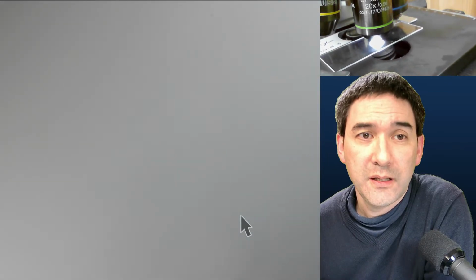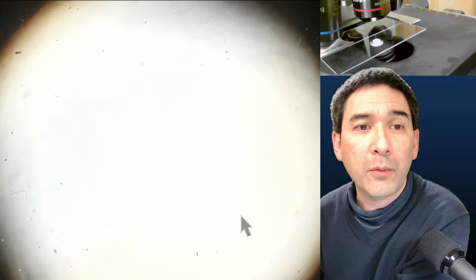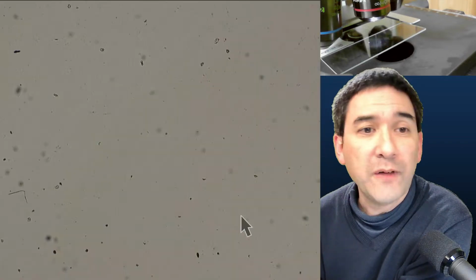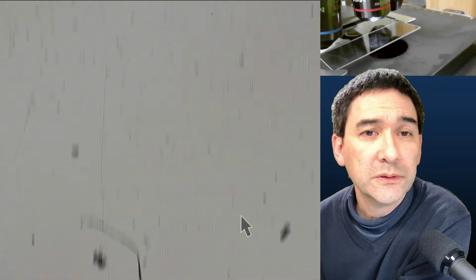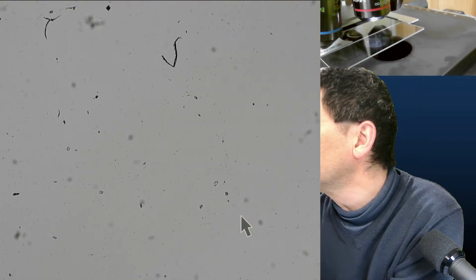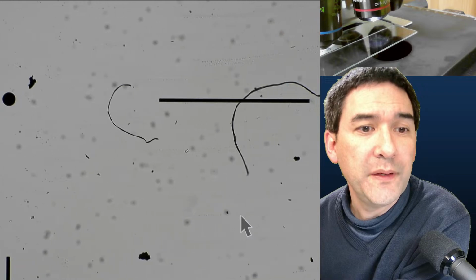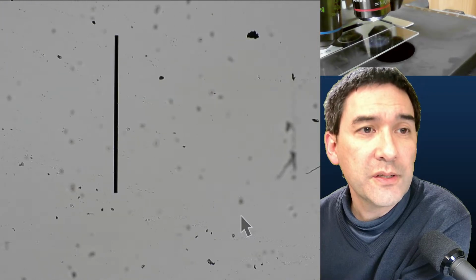Oh, okay, that's the thing. See, there's dust and dirt. So what I have to do now, this is using my 20 times objective. I'm going to go down all the way to the low power, simply so it's easier for me to find what I want to look for. Lots of dust and dirt. Was there something here? Here's a line.